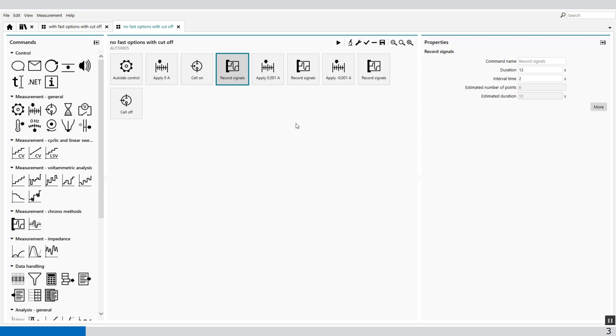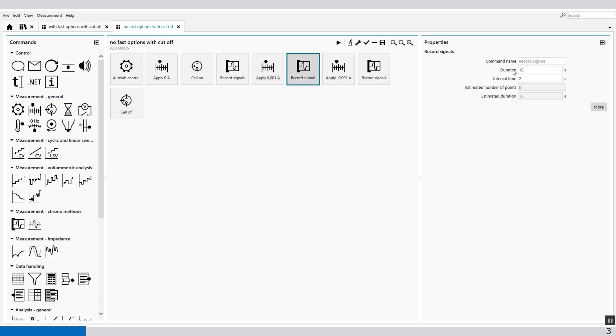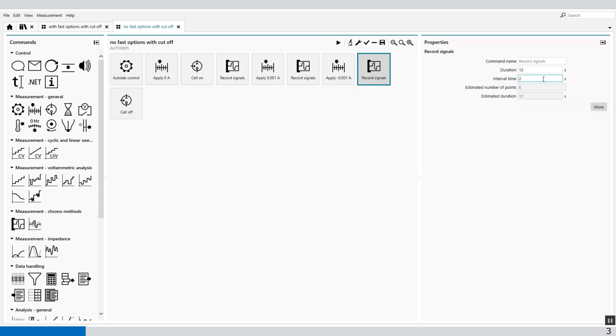I've connected the potential set to a battery and I apply 1 milliamp and then record a signal again for 12 seconds and the interval time of 2 seconds. Then I apply minus 1 milliamp and again 12 seconds and 2 seconds interval time.